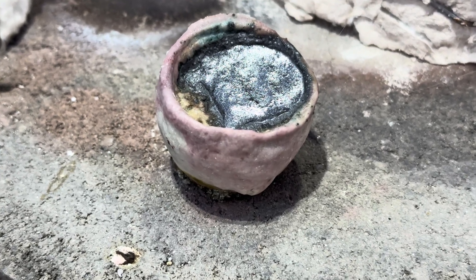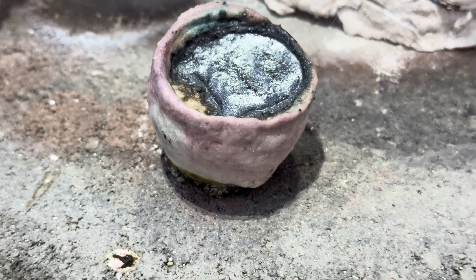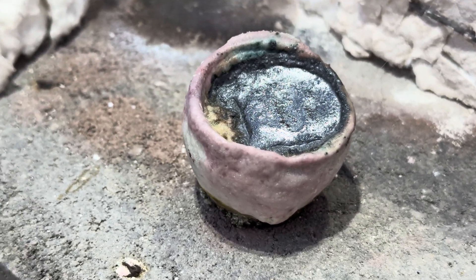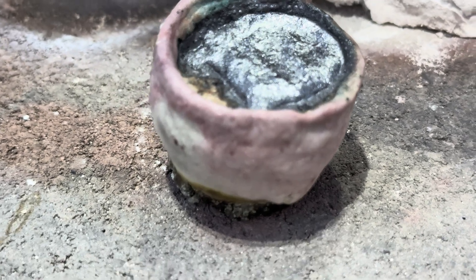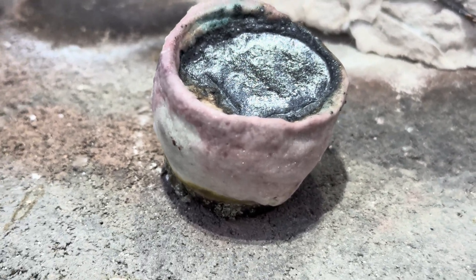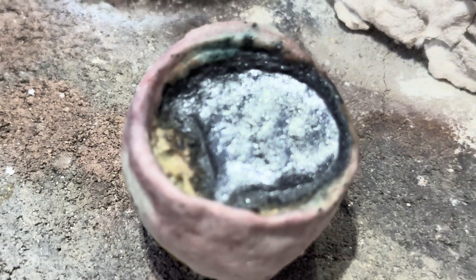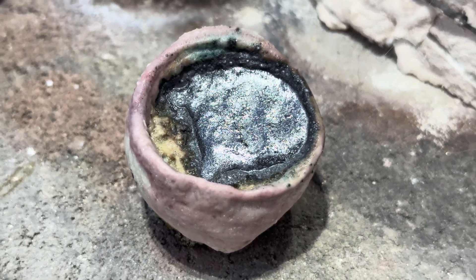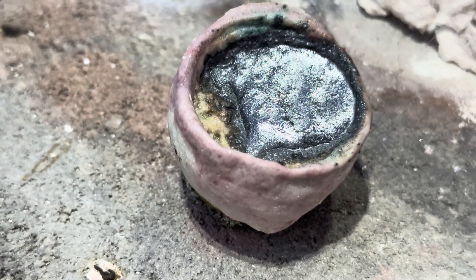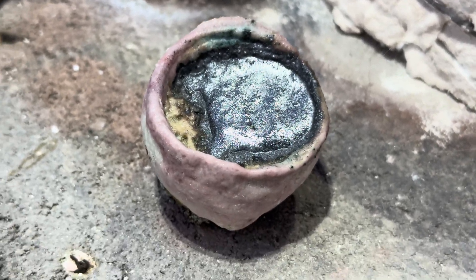You can see with the extreme heat that we got up to between 2,400 and 2,500 degrees that the cupel is pretty messed up, and I'm sure the massive amount of borax I had put in there assisted with that. But really nothing happened with our prill — now our prill is deformed. We're waiting for it to cool off and I'm going to see if I can get that prill out and see what's going on with it.